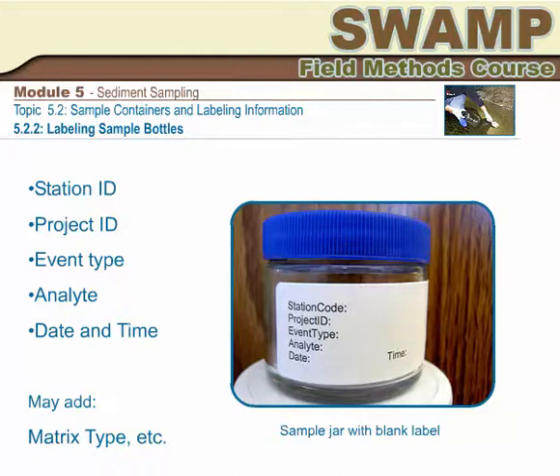If you are not delivering your samples to the SWAMP laboratories, check out the requirements of your lab and data tracking system. They may ask that you use their labels to facilitate the sample tracking on their end. At a minimum, record your own station ID or sample ID if it includes the station already, as well as the sampling date and time on the label.